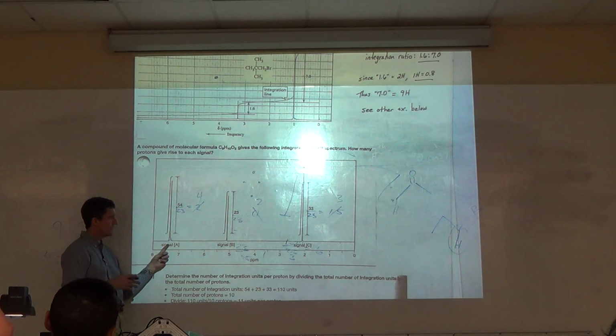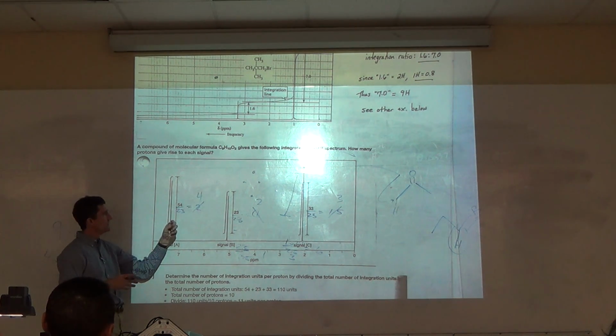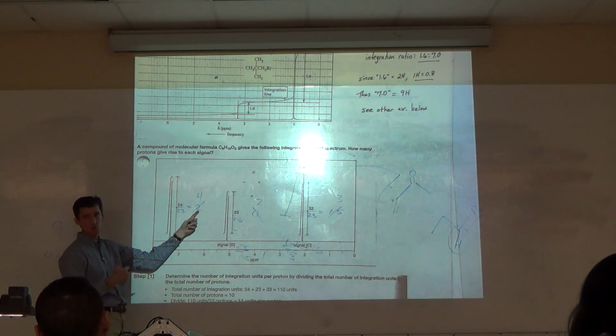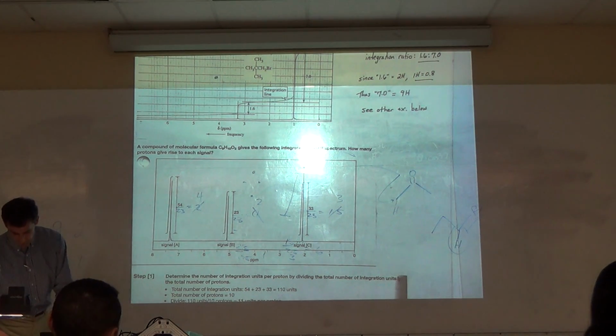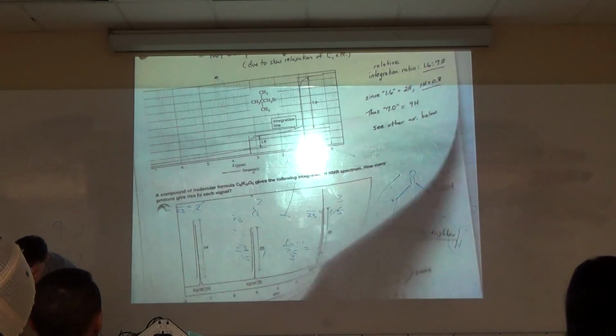Now, I know this compound, and that should actually be 5. That's because we rounded it to 2. That was a low rounding. It's more like 2.5 almost. And if we call it 2.5, we would have listed 5 when we doubled it. Okay. So there's some information there.